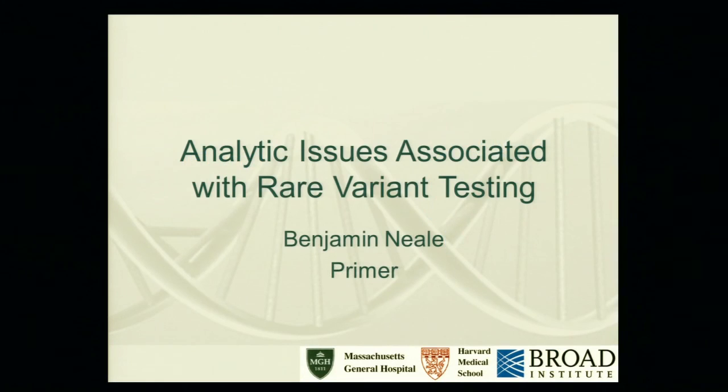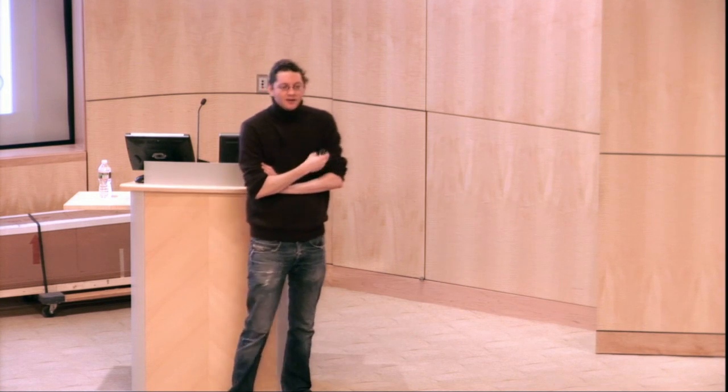All right. Okay, so I will be talking about sequencing analysis, and I think I'm the only sequencing talk from the primer point of view. So I'll try and give a little bit of a melange of the concepts behind sequencing, where the data come from, some of the study design issues, and then try and touch on some of the analytic issues and approaches.